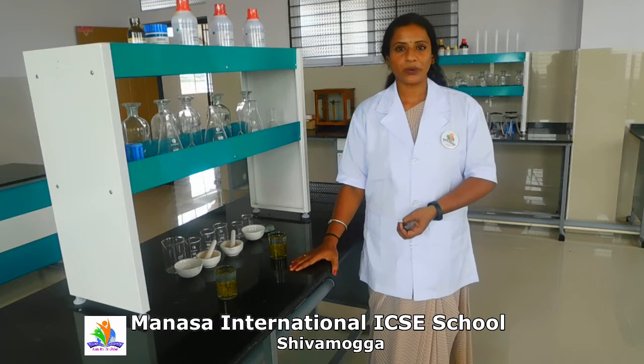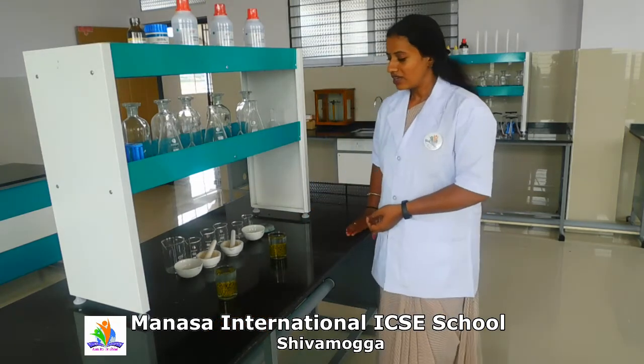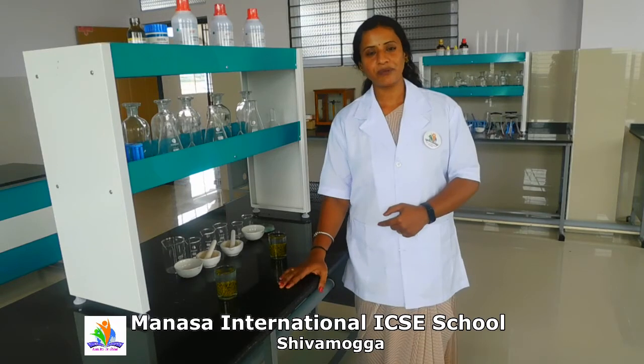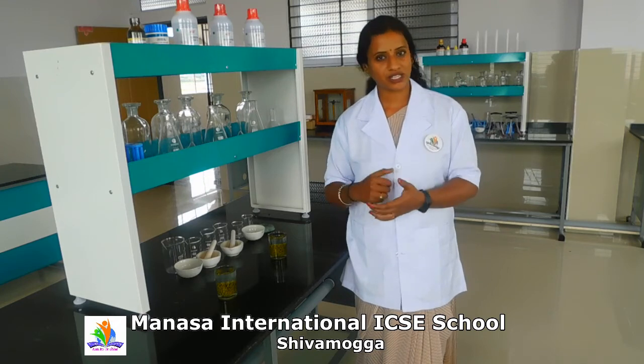First and foremost, I would like to introduce what is a working table. So this is what we call a working table. Each student or every person who works in the laboratory should wear this apron. This is called an apron. This is a precautionary measure while conducting some of the experiments.